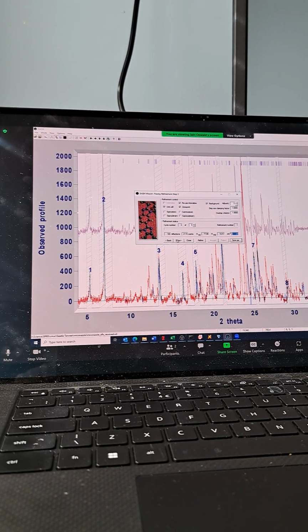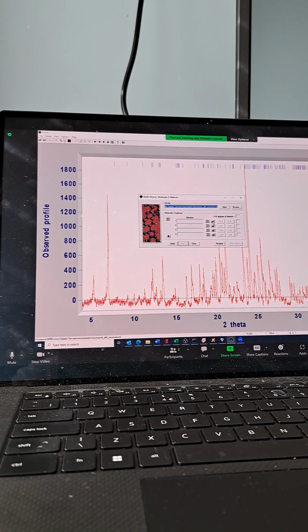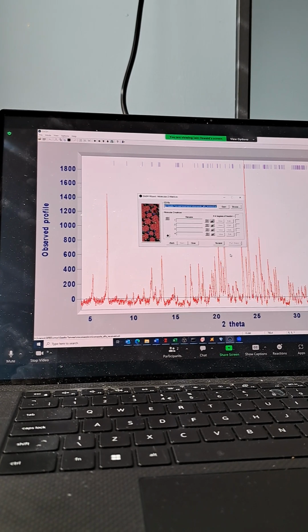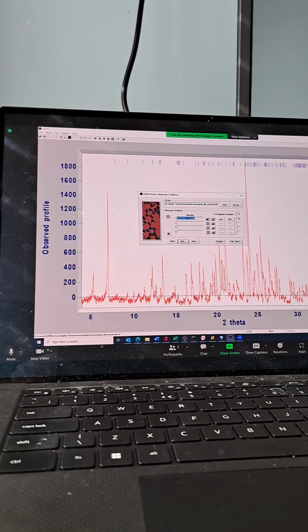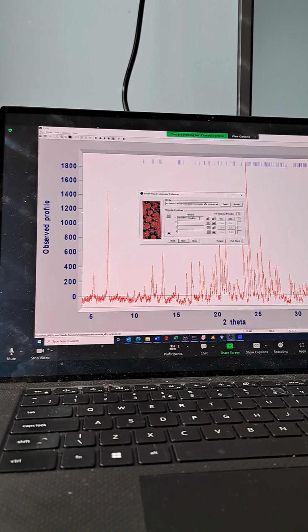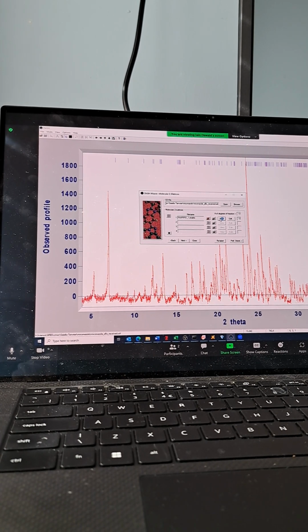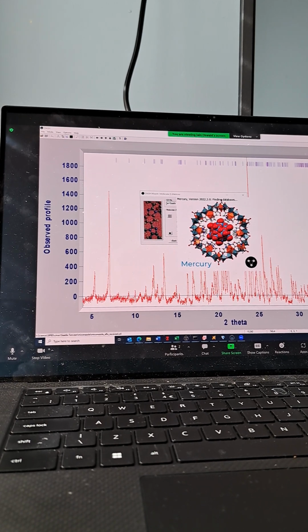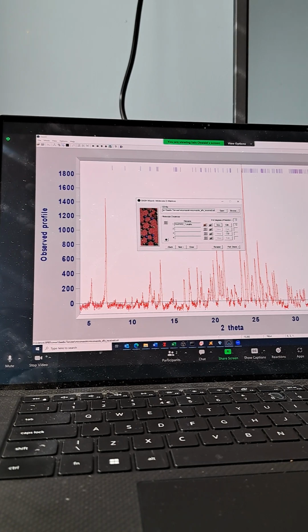But what we then do is go onto the solve button, and in here, this is where we're talking about putting in PAVPIP, for example. Now, I put in my CIF file, but what it does is convert it to a Z-matrix, and I can view this. It will view this in Mercury, so it allows me to see what the material is.